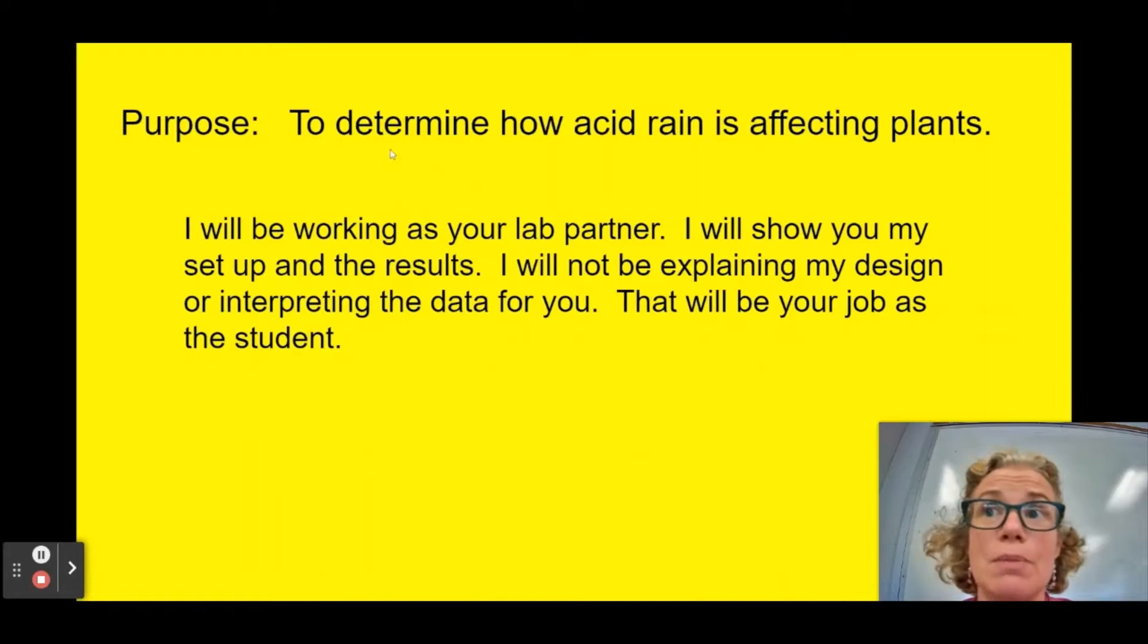The purpose of this experiment is to determine how acid rain is affecting plants. I'm going to be working as a lab partner, so I'm going to show you what I'm doing and show you the results, but I'm not going to interpret the data for you because that's your job as a student. I made this lab so that if you are absent or working from home you can still participate in the lab experience.